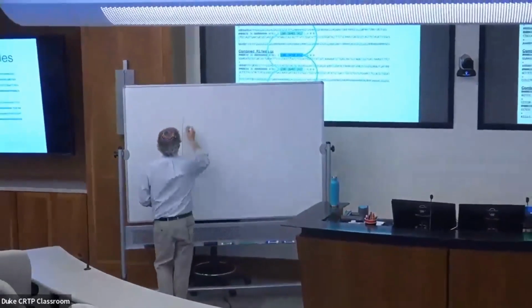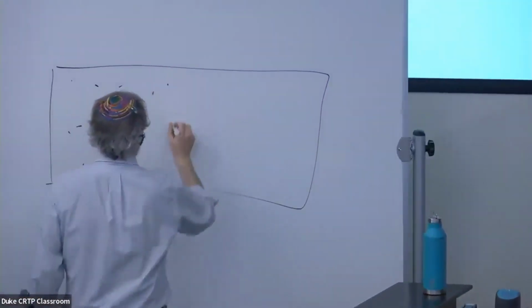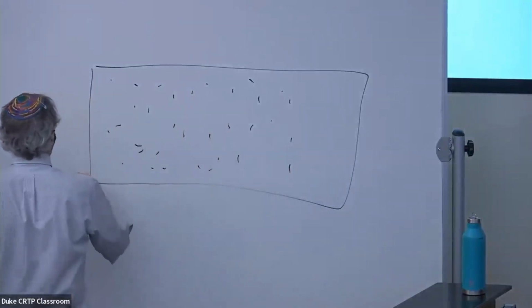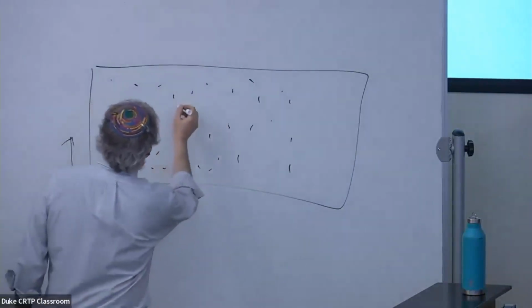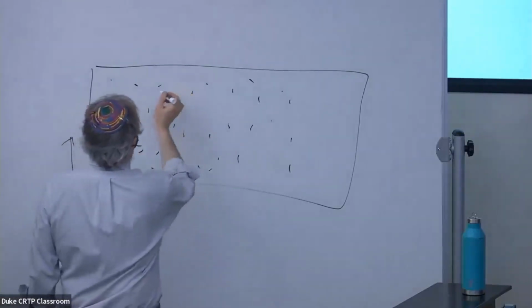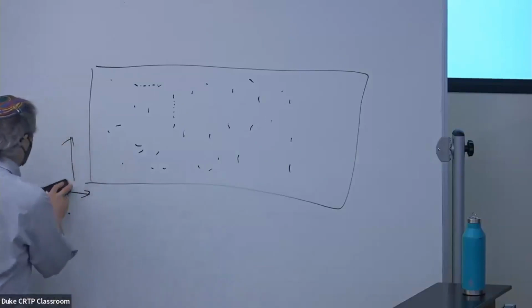so here's a flow cell. Those are the spots. We'll call this X, and that's Y. Right, so these two spots, maybe they have the same X coordinate, but different Y coordinates. These two spots have the same, wait, excuse my writing.